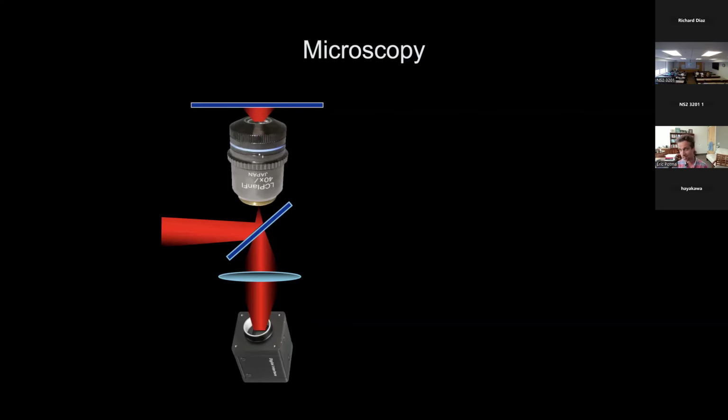Microscopy is fantastic. It's a great way to investigate biological samples, and the key is really to have a lens system that has a proper magnification and resolution. So these objective lenses are fantastic. Nowadays they are just approaching their theoretical limits, and you can purchase one for a couple of thousand dollars and see things at the submicron scale, which is absolutely brilliant.